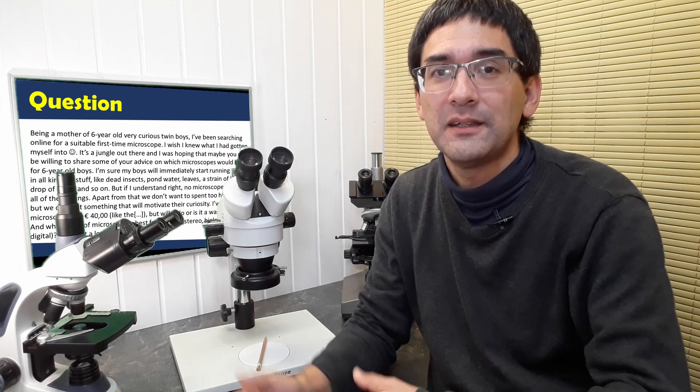You have to get yourself, or for your boys, a so-called stereo microscope. I have a very strong opinion about that. And the microscope that you have pasted in the email, in the link, is actually a toy microscope. It's a compound toy microscope, which is mostly made of plastic. Now, this does not automatically mean that they're of bad quality, but I consider them generally to not be very suitable for very young children. They have to be already a little bit older.